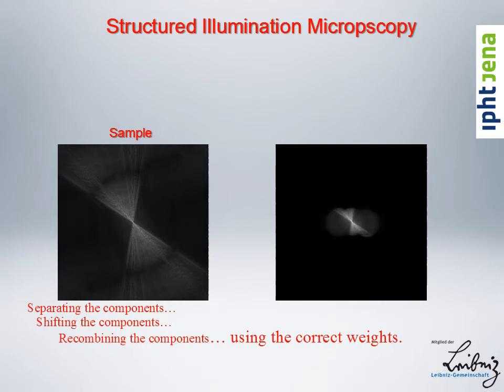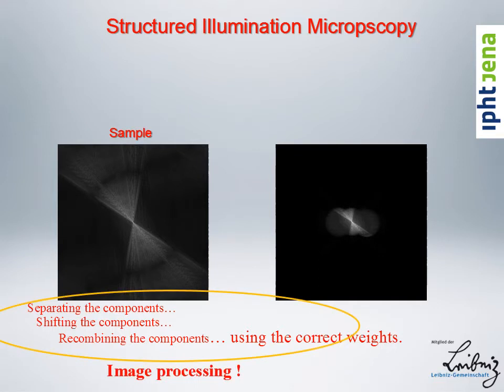And this way we've increased the resolution, but by this animation you also see that we have only gained resolution really in one direction of space, in this case along the x-axis, but not along the y-axis. Our resolution is still limited by Abbe's original frequency in the y direction. So how can we fix that? Well, of course, we just repeat that experiment in a different direction. If you did it now only in y, you would have a problem with the diagonals. That's why typically it is done in 3 different directions, and you then get almost isotropic resolution improvement.